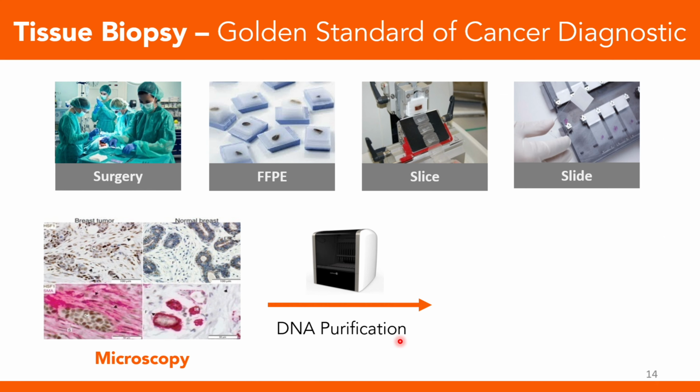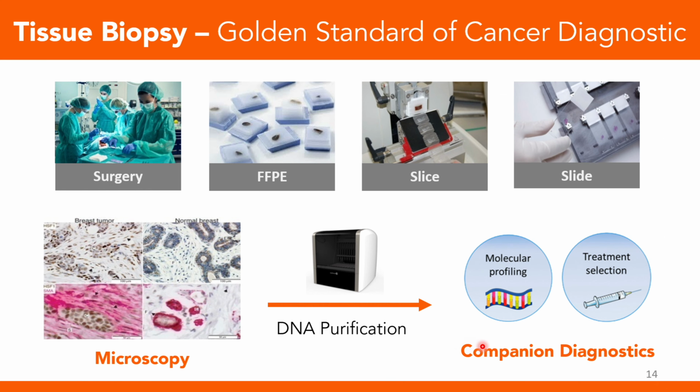And from this sample, we can do DNA purification and check the molecular profiling to select a proper treatment for the same kind of cancer.